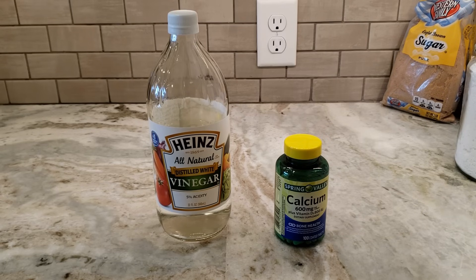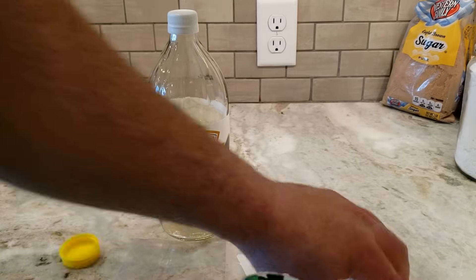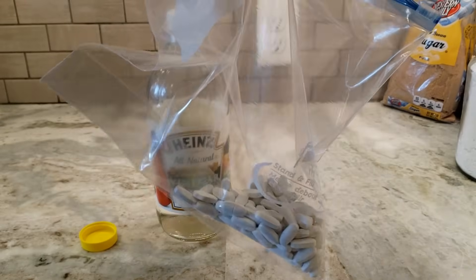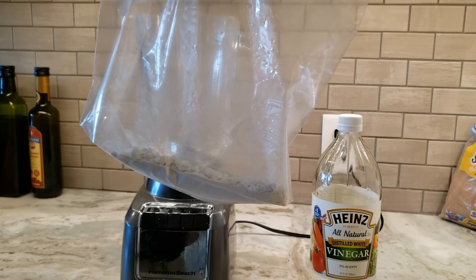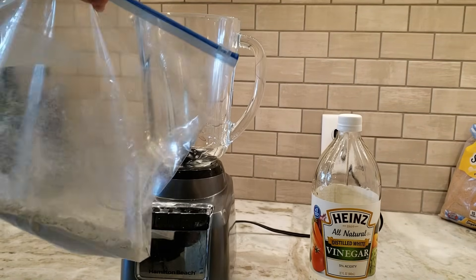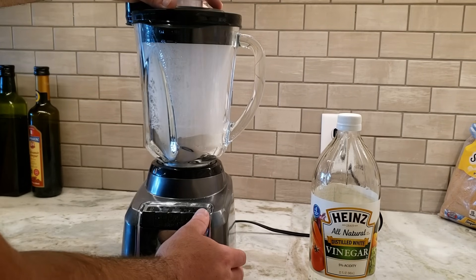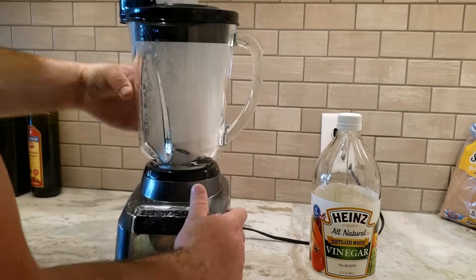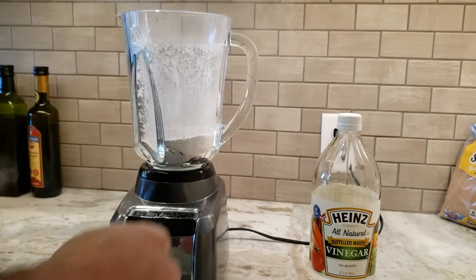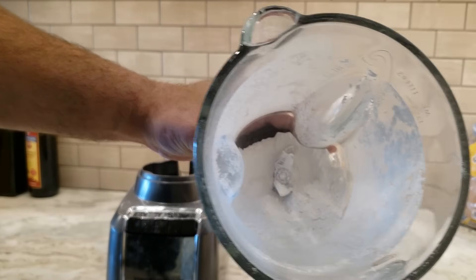First, we're going to have to crush these pills. We're going to put them into a big Ziploc bag and crush them with a hammer into smaller chunks, and then dump them in this blender to get it into a really fine dust. Now we've got it down to a pretty fine powder and we are ready to move on to the next step.